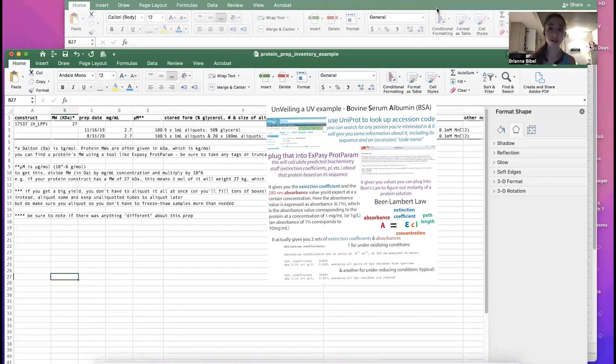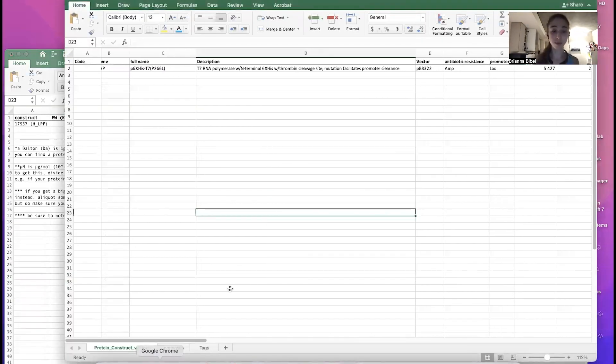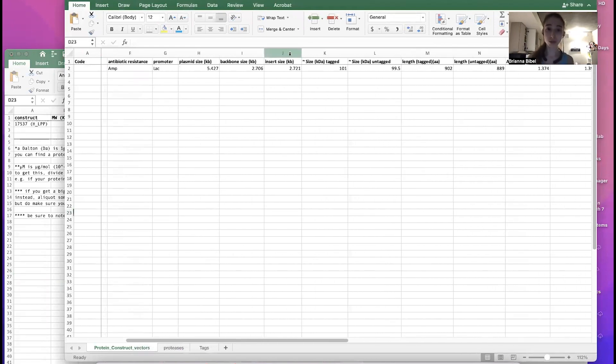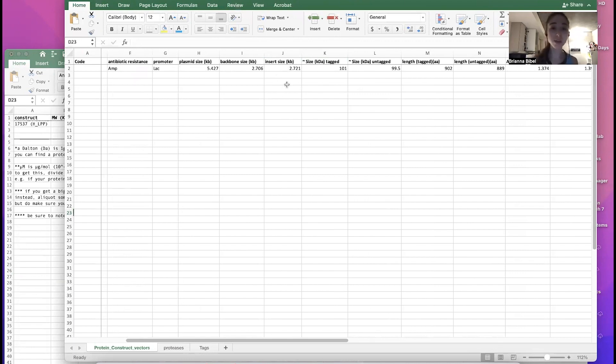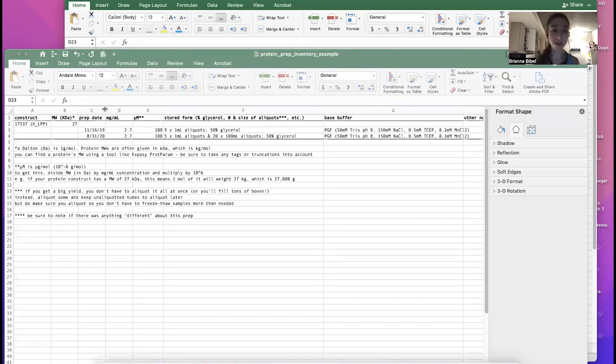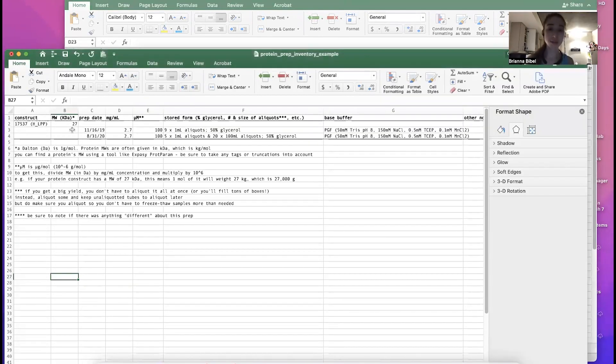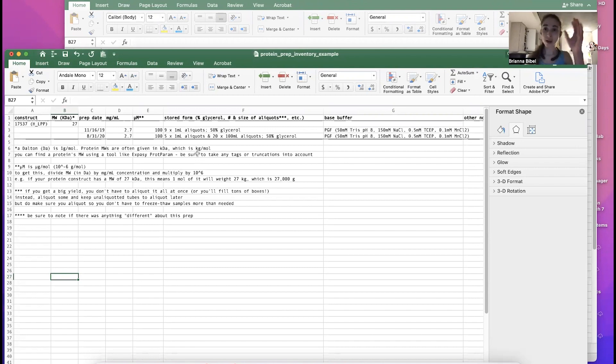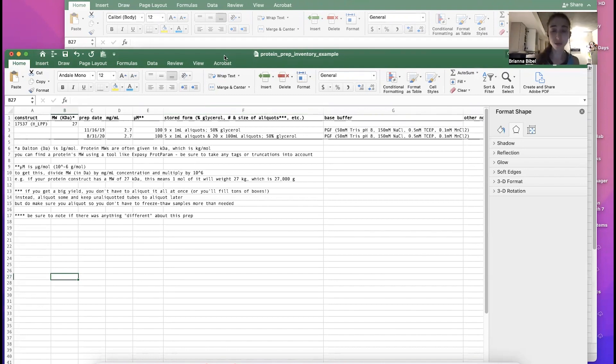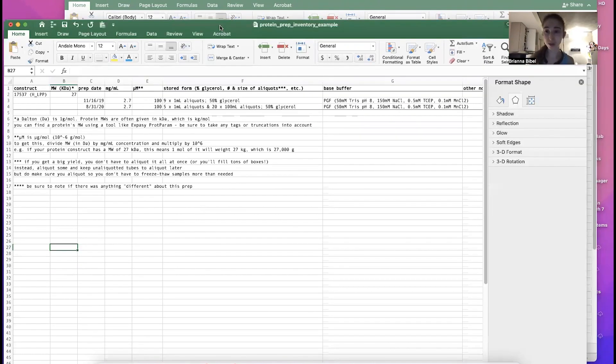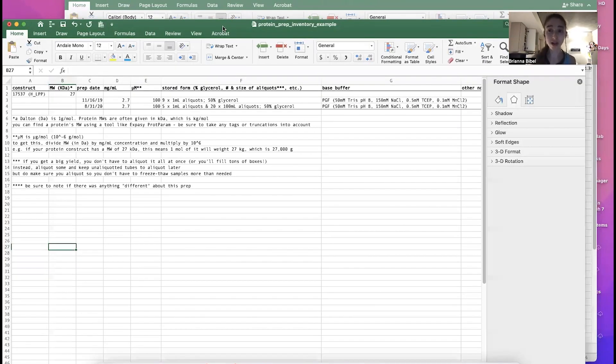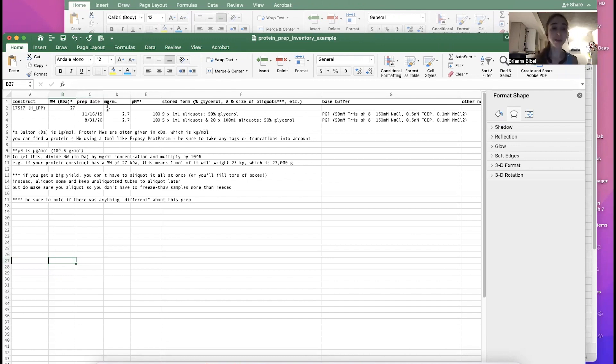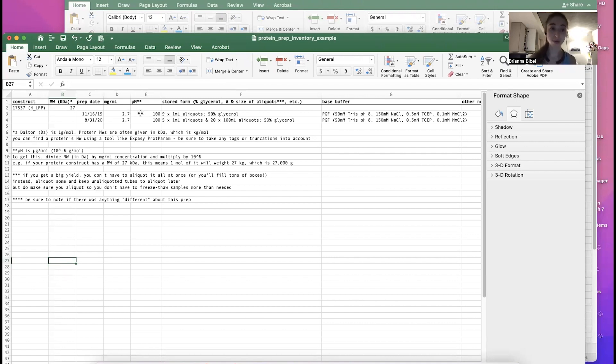And so I talked yesterday about how we can put, how I put this information into my construct inventory, so my plasmid inventory database. And so if you have it here already, it makes it really easy to find it and put it over here. If not, you can always look it up now. And remember to take into account any tags or any truncations to your construct. So maybe if you cut part of the protein off, or maybe it's disordered so it's hindering your expression so you cut it off. Make sure you take that into account when you're figuring out the molecular weight, because that will change it. But anyway, the reason we put it here is because it's going to help us convert between the mg/mL and the micromolar.